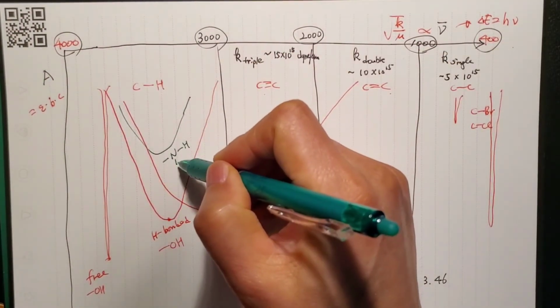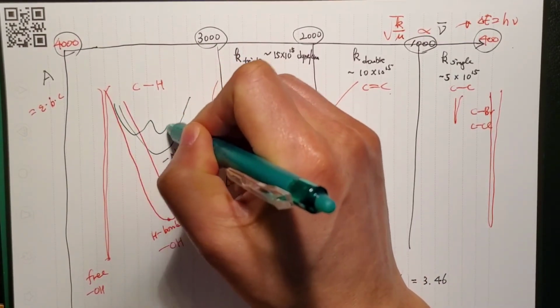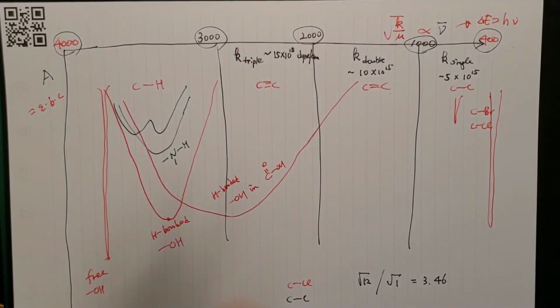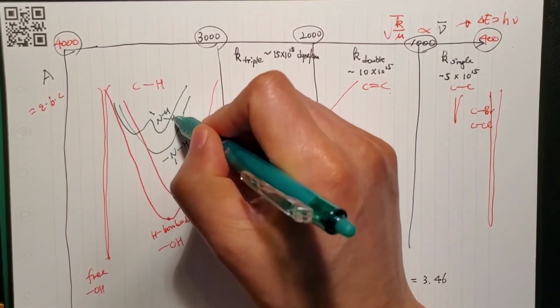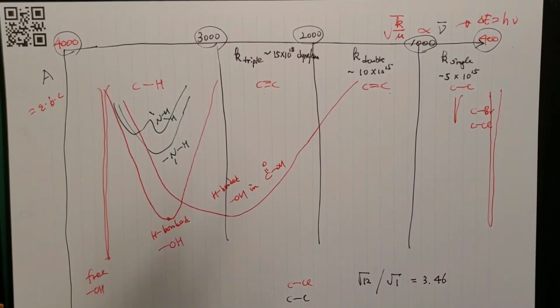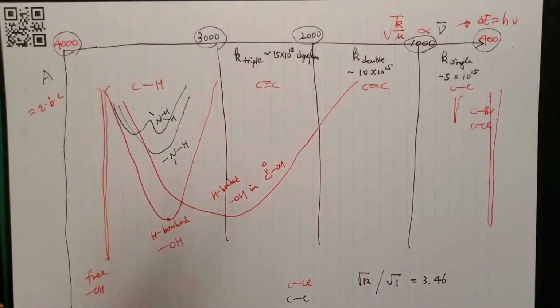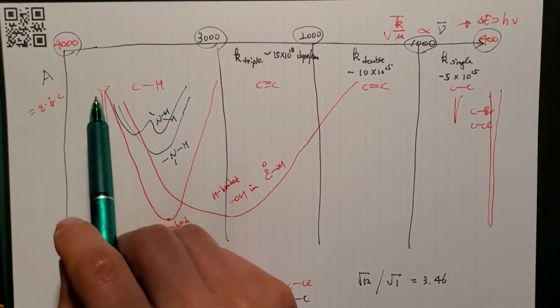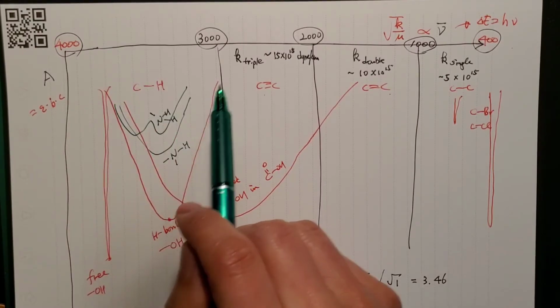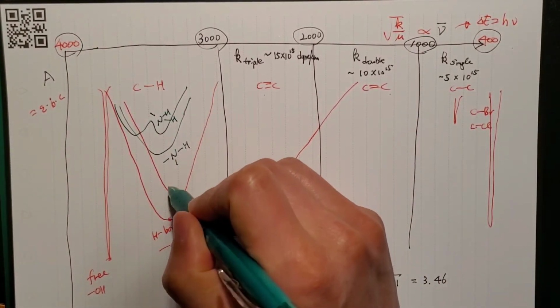But if you have an NH2, the primary amine, you expect that to be like double the mountains of NH. So you have two signals. When you read the frequency, you can say from 3000-something to 3000-something, or you can read the maximum value.